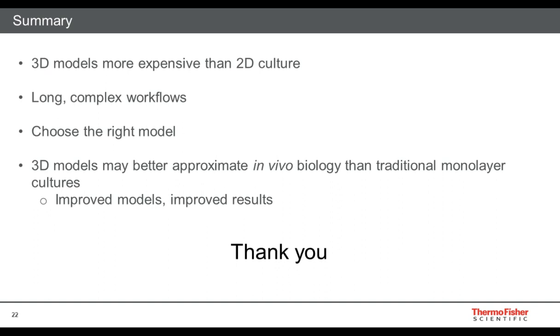That's also a very good question, and one that doesn't have an easy answer. At the end of the day, it's really going to require testing to find out, one, how healthy is the sample I made? Do I just have a ball of mostly dead cells? And what impact is that going to have on my model? Is it big enough? Is it too large? Does it have the cell types that are relevant? There's unfortunately no standard way of knowing if it's exactly what you need in advance of doing that sort of testing.